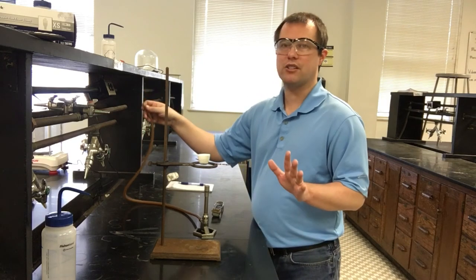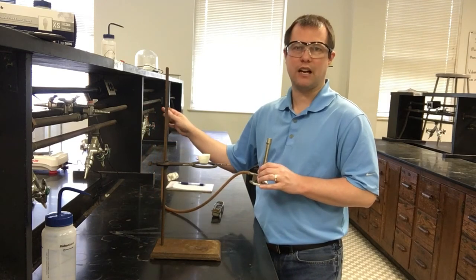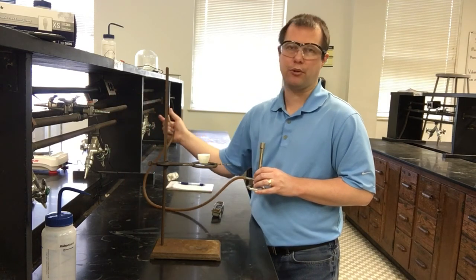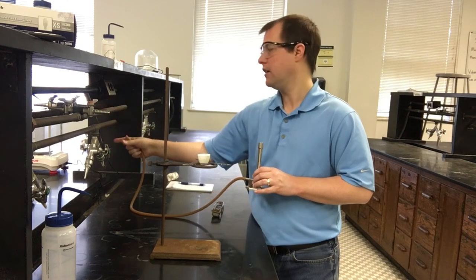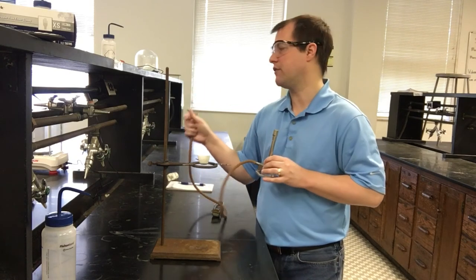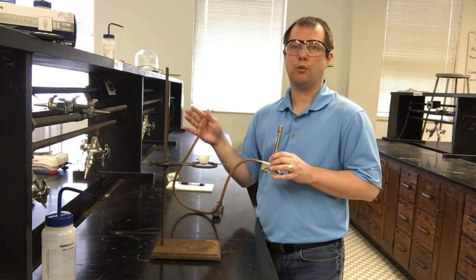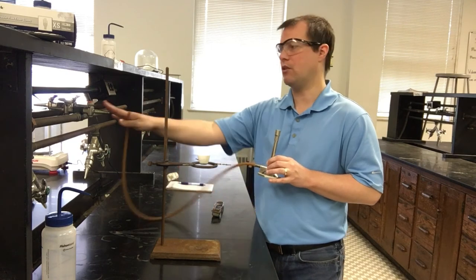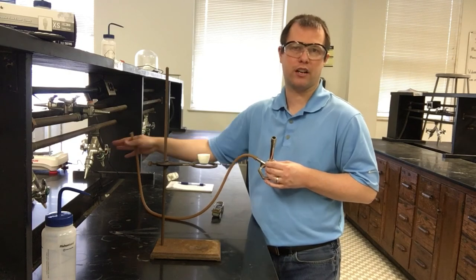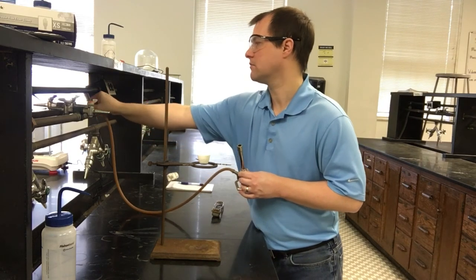To get the Bunsen burner set up, there are three different spigots on our bench tops. One has an orange knob, one has a blue or green knob. Orange is for air, blue is for natural gas, and green is for water. It's important to hook up to the blue knob — the natural gas line — because if you hook up to the orange you'll never get a flame, and if you hook up to the green you'll get a very wet surprise.